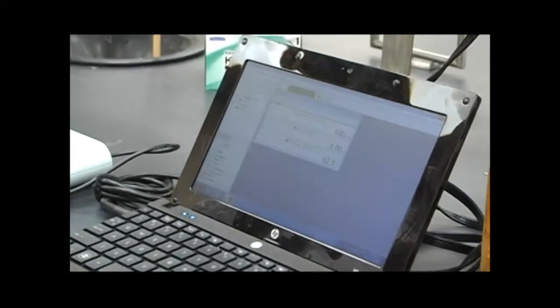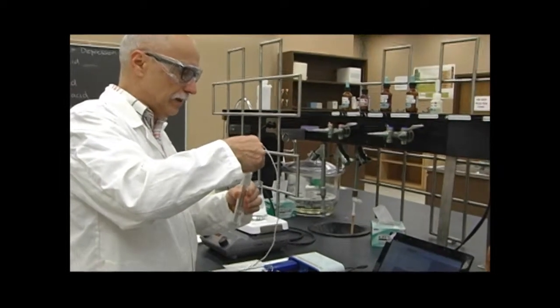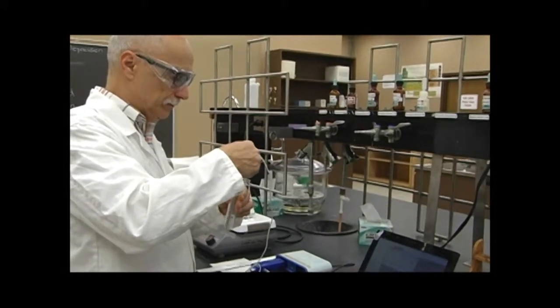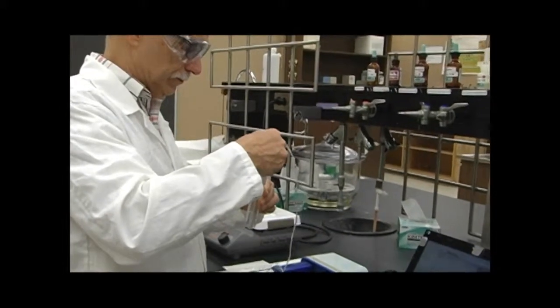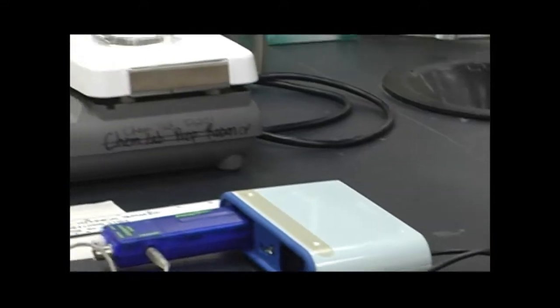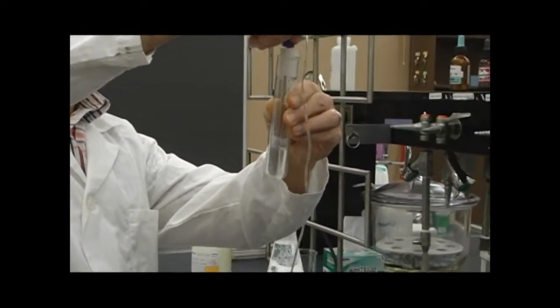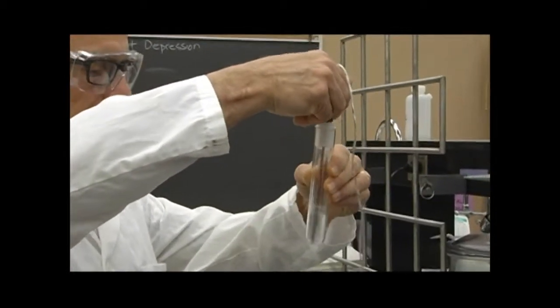It's coming down, continuously stirring it so that the heat and the cooling is uniform. So we're going to see what the plateau looks like. So can't really see it yet. Oh, there. You can see the slush starting to form, and it's at 43.5.